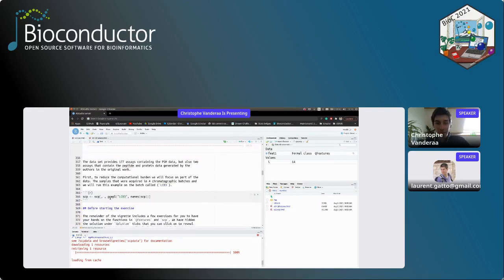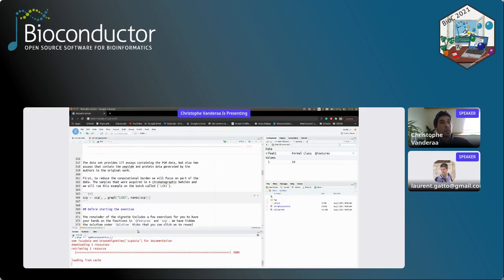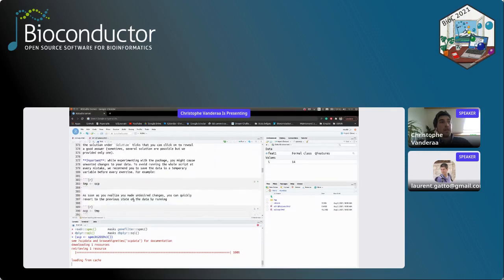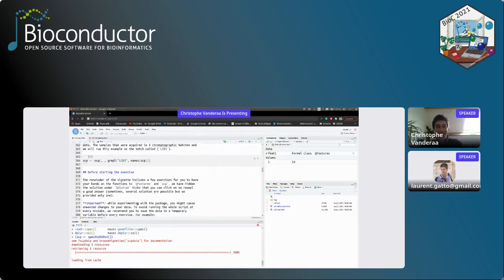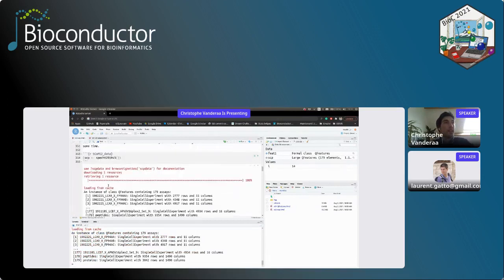It can take some time because it's a big dataset. Okay, it's taking quite some time, sorry for that. If you want to have a little drink, it's probably the right time. Excellent. Okay, so now it retrieved the data.